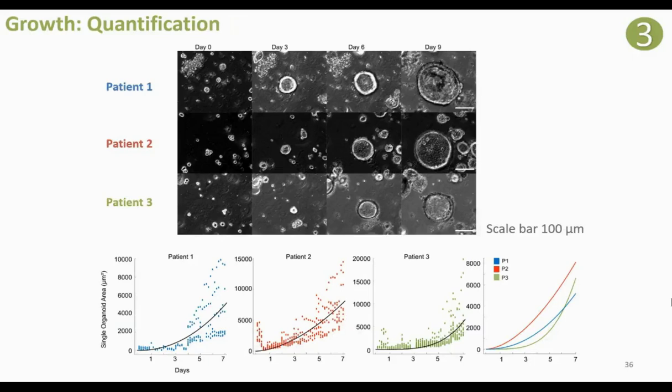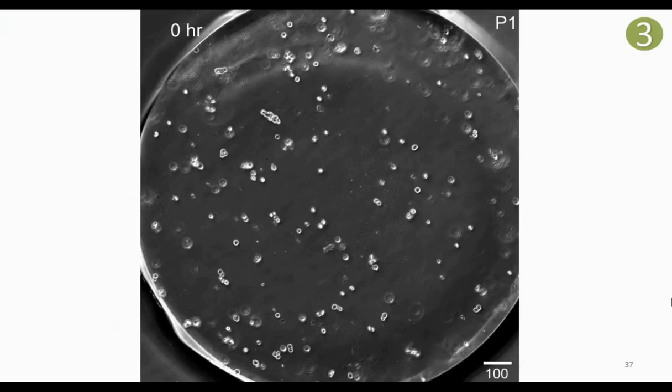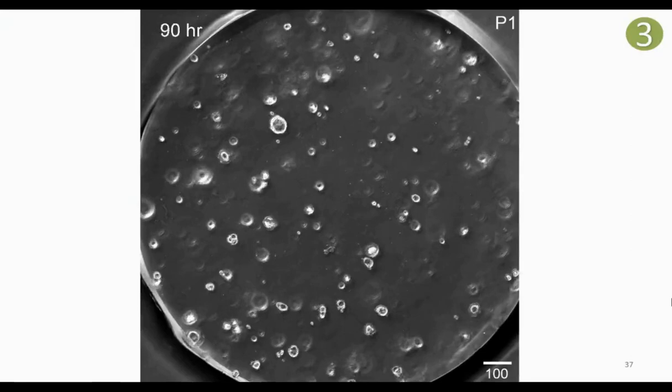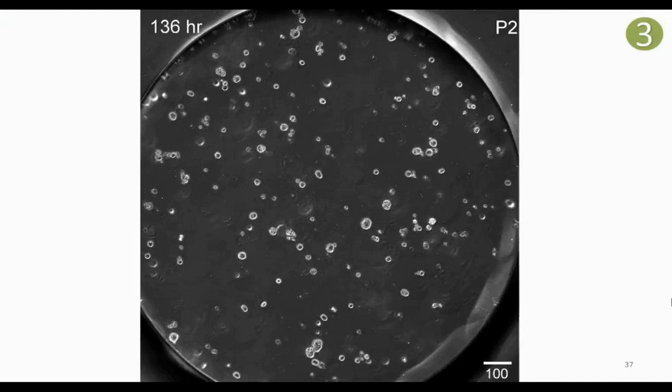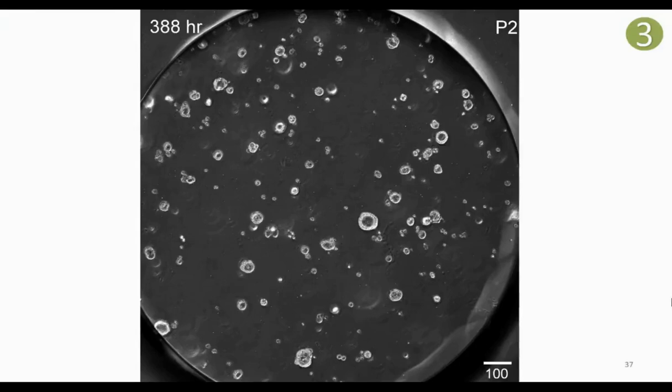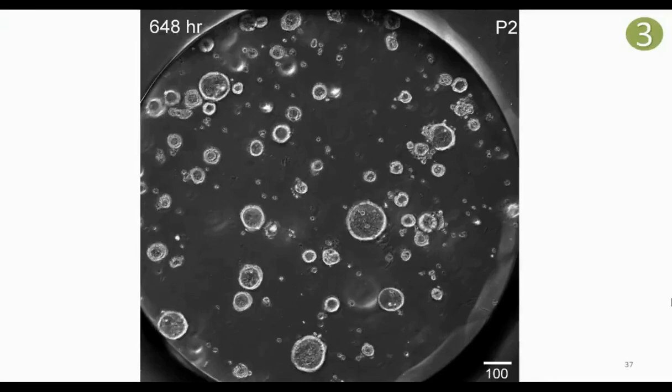Here's an example of an organoid growth video. We have patient one going from single cells to multicellular organoids — we can watch them grow. Here's patient two, and you can see a hydrogel bubble — the platform is designed to remove those so they don't affect our imaging. And then finally, patient three.